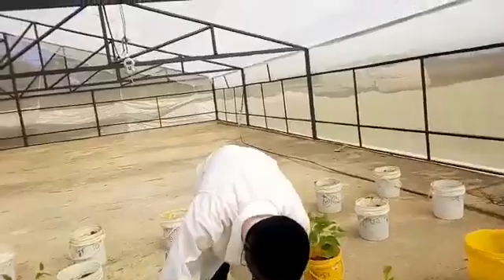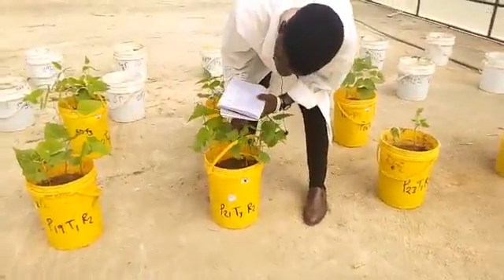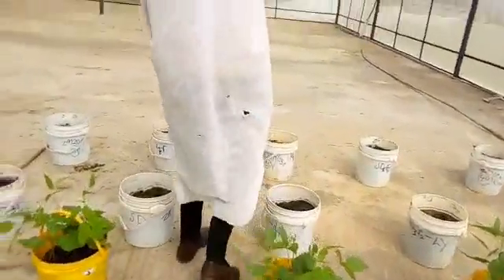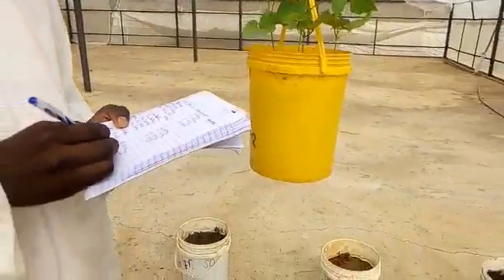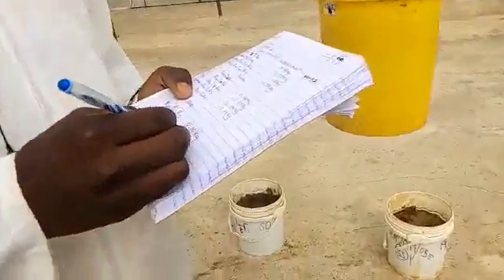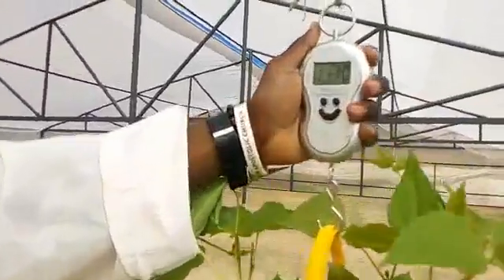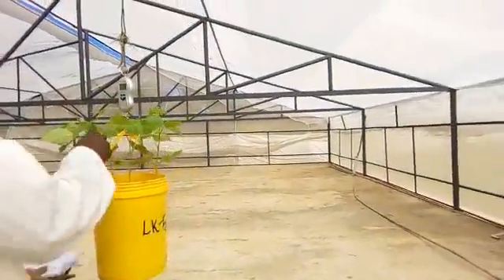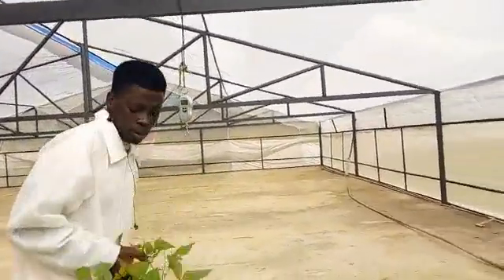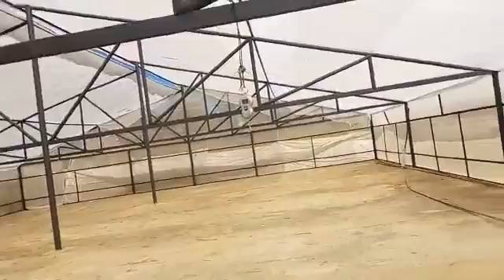So we're just going to pick out a different treatment so that we see how. Remember we mentioned that these soils percolate at different rates. So the next treatment that we are checking is our treatment 3, which is Lokopa. And what is the reading? That's 11.70. Danny is just taking that record. Okay, so as you can see, it's different. The other one that we used was about 12 kgs. This one is at 11, and so that shows the need for us to check each soil and see how much it requires, because it's different.